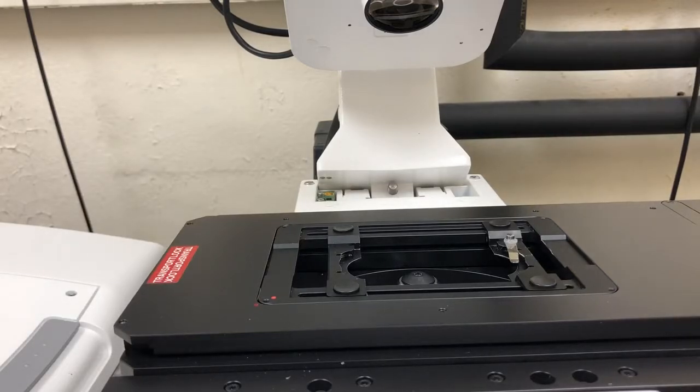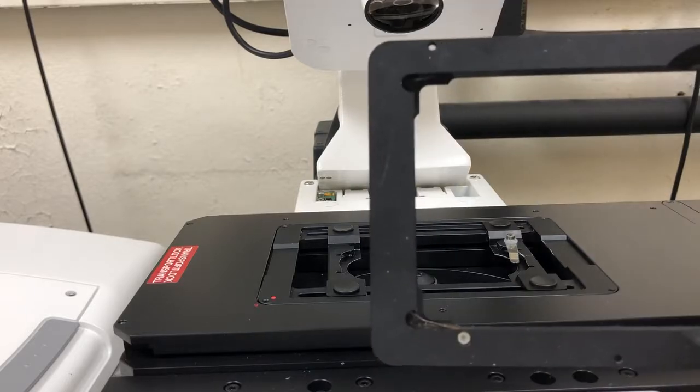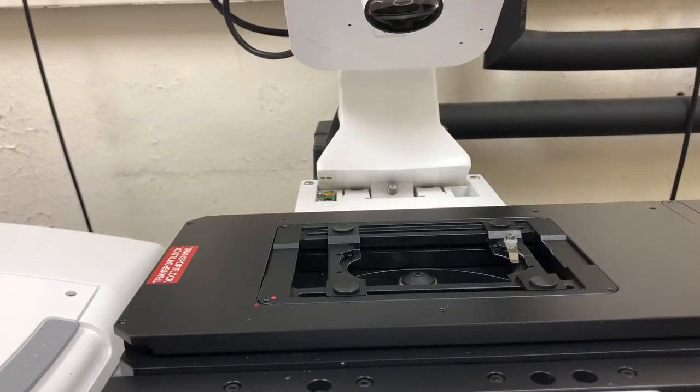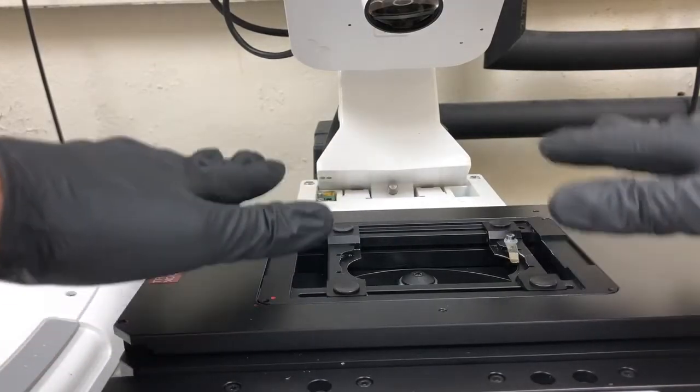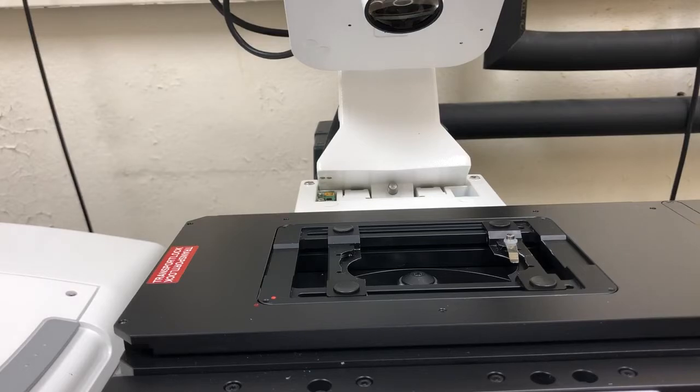Then go to load position to lower the objective so that it is far away from everything we're going to manipulate here. If this is not the right holder — for example, if someone forgot the plate holder in — you want to remove it and swap it for the one you want. Furthermore, if it's not in the proper position and something is off, you may need to remove it and put it back in.